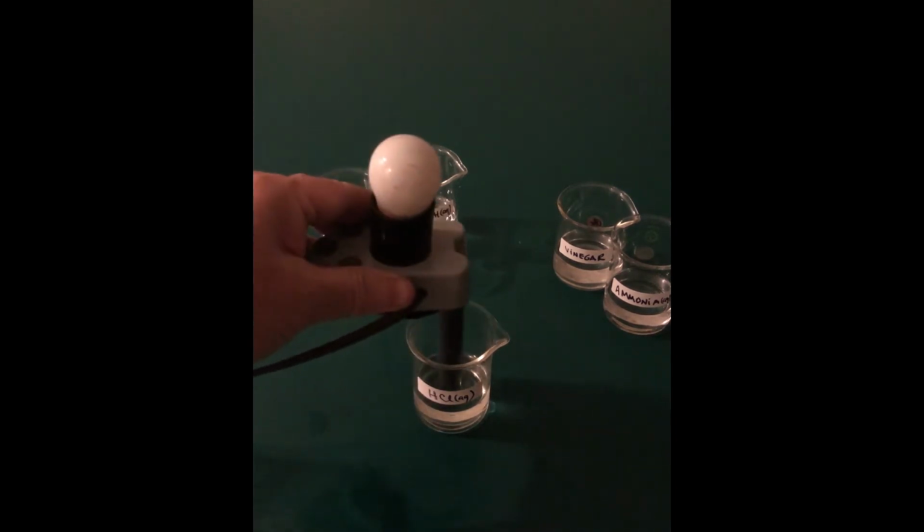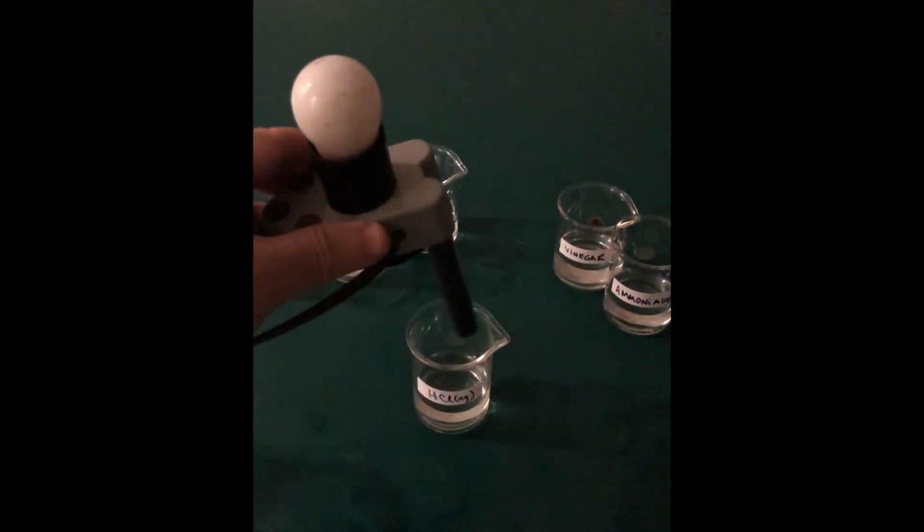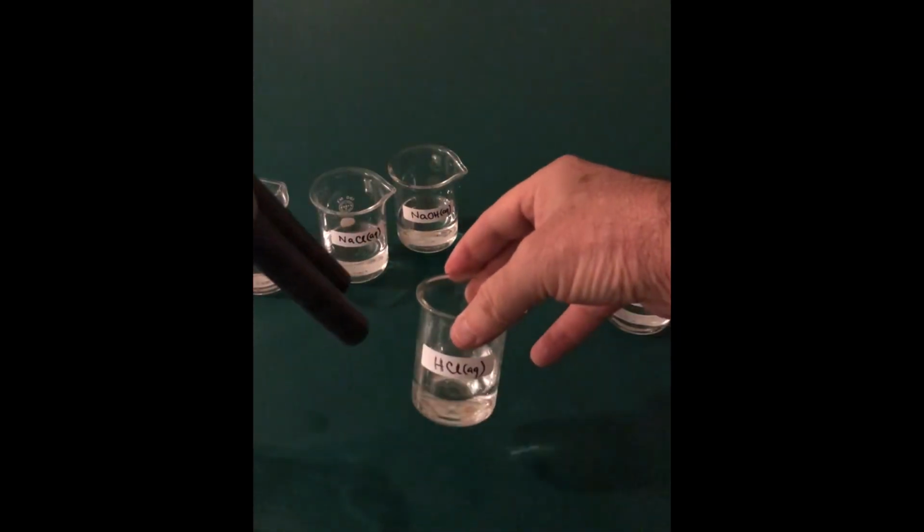Let's see HCl. HCl, hydrogen chloride, is typically a gas, but when you dissolve it in water, we call it hydrochloric acid. So let's see what happens in this case. There you go, very bright light, which means that even though HCl is a molecular compound, when you put it in water, it causes water or the solution to conduct electricity.